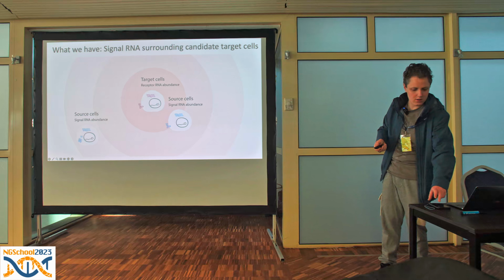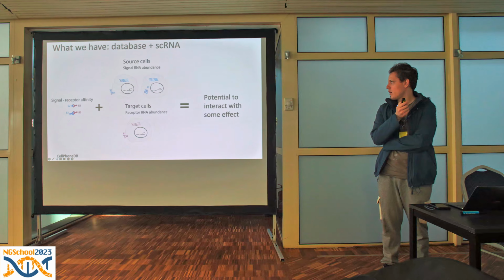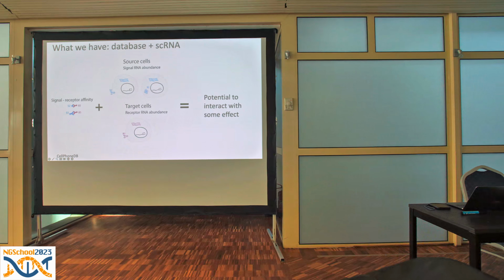So basically, when you do cell communication analysis in single-cell RNA sequencing, you see the presence of mRNA for a receptor on one cell type and for a ligand on another cell type, and then you just assume that they may communicate. Spatially, if you have this information and you know that these cells, this receptor and ligand, are close to each other, then you just assume by default that they're communicating.